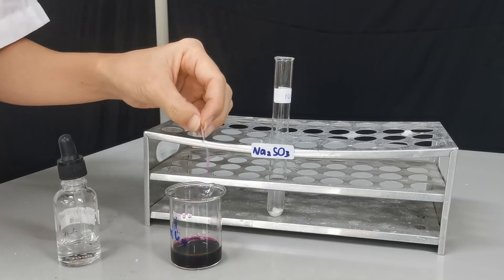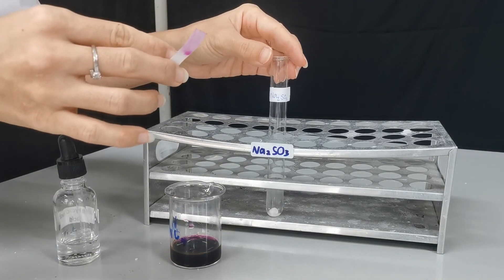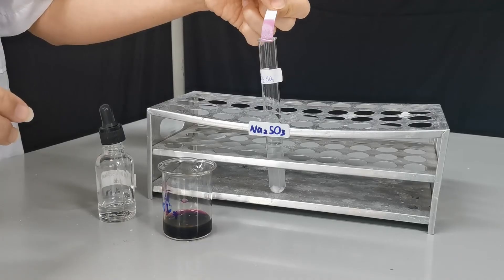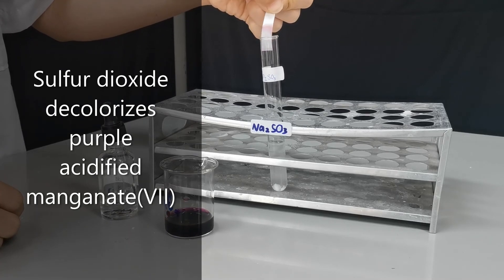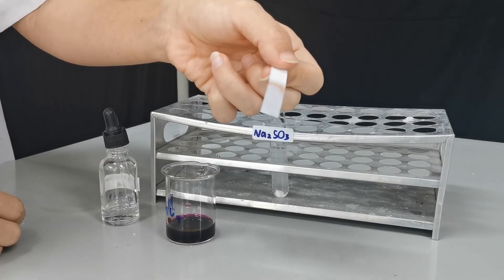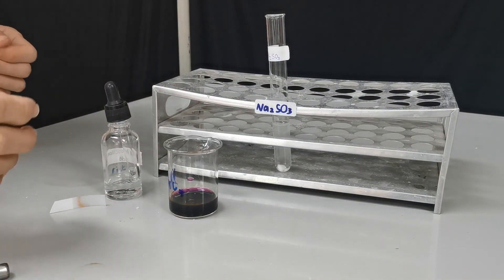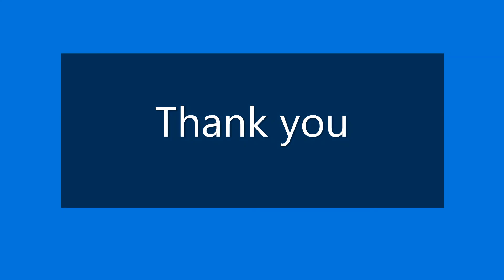Potassium manganate VII is purple in color and is a very good oxidizing agent. When sulfur dioxide is present, it is going to oxidize sulfur dioxide to sulfur trioxide. We put this at the mouth of the tube, and you can see that the purple color of potassium manganate VII has been decolorized — from purple to colorless — confirming that sulfur dioxide gas is present. When you smell it, it makes you want to cough.